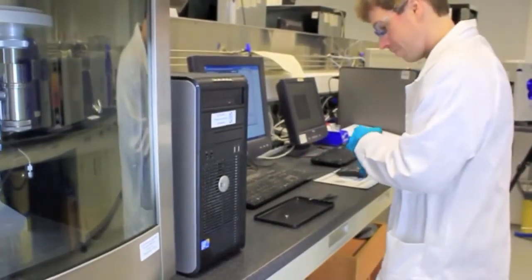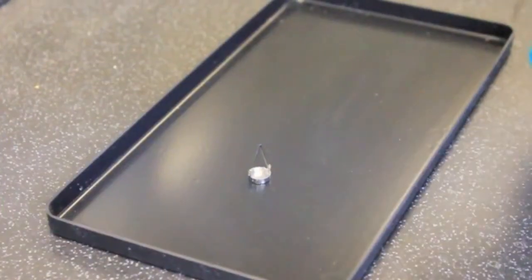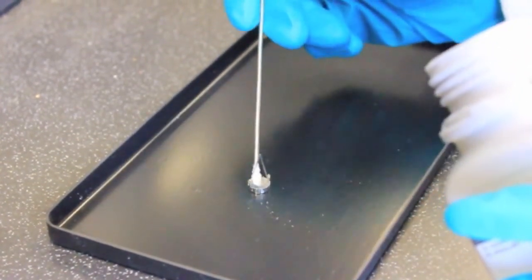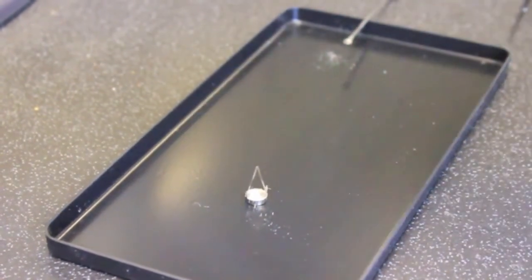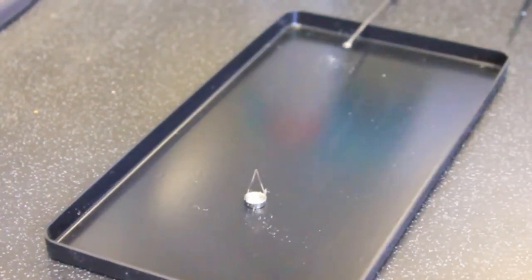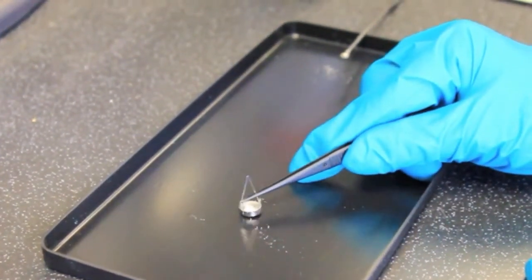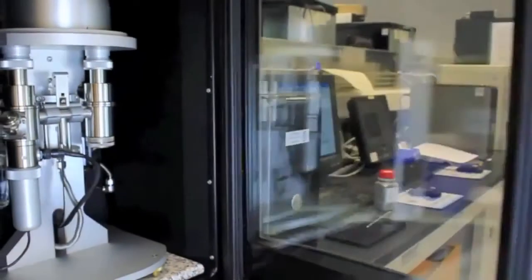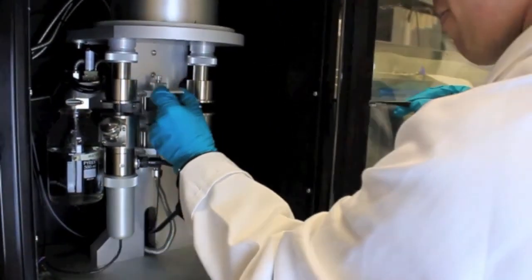Let me explain how the DVS method works practically. We start by taking a small amount of the sample we want to study. Typically quite a small amount of material, about 10 milligrams, which is the size of rather a large match head. And that's all the material we need to do a full characterization of our material. We'll take that material, put it in a small glass pan, and we'll attach that to a very sensitive microbalance. In the DVS instruments, we use microbalances that have a resolution of 0.1 microgram, and they can measure mass changes up to 1 gram. So we're able to measure very small changes in sample mass.